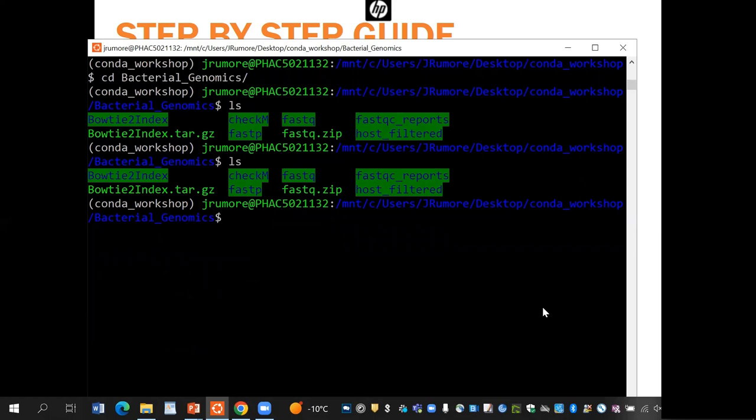Because this will be the last exercise for today. Unfortunately, we're not going to be able to see the results of CheckM. It does take about 8 minutes to run. If you'd like to stick around and wait for the results to complete, you're more than welcome to. But like I said, it takes around 8 to 10 minutes. It's quite lengthy.